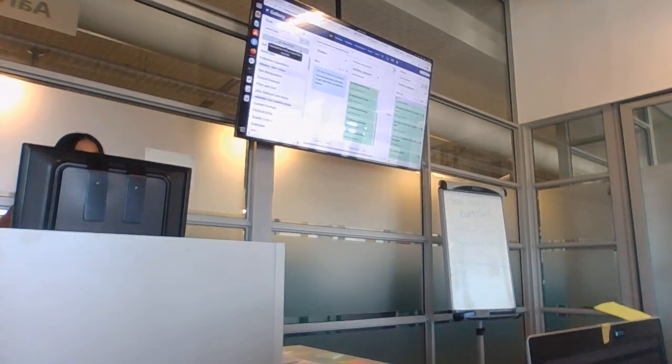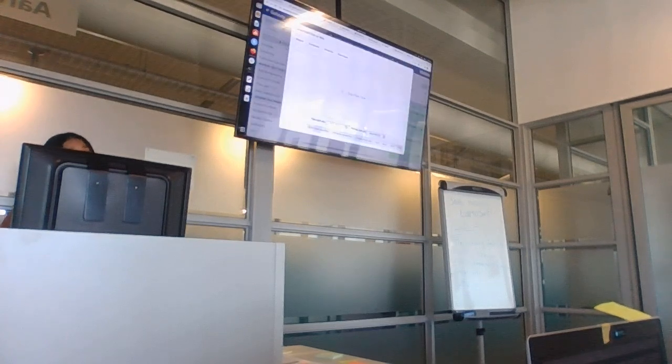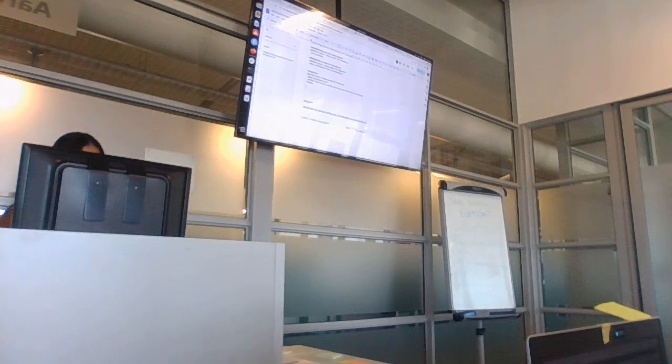And then you're going to have to upload this again. I've pasted this just in case onto the NGS Bioinformatics Google Doc. Paste this into your URL so that it downloads. Dafa, you already have it. And you, because you had an issue with downloading from Zenodo.